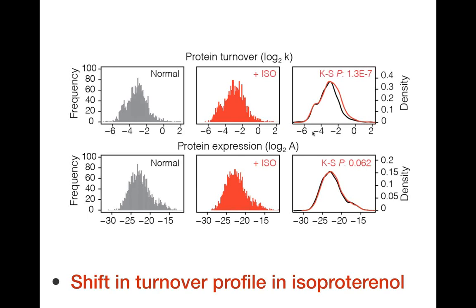Here we are actually looking at the total proteins. Total proteins. So did you spin out the, this is all cardiac, so did you do a low speed spin and then you took the entire supernatant and you didn't fractionate any further, is what you're saying, right?